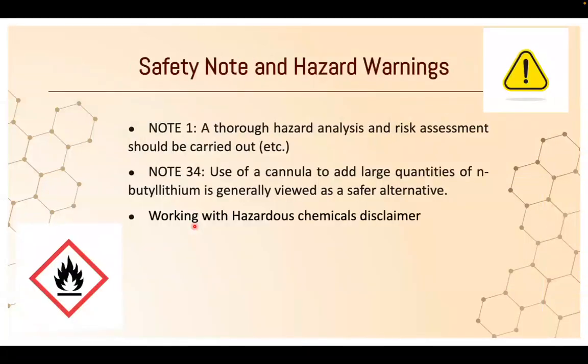Safety notes and hazard warnings. Safety notes included were regarding the cannula used to add large quantities of n-butyllithium. This was seen as a safer option due to how highly flammable and reactive the substance is, because n-butyllithium poses a danger when using the chemical in a lab setting.